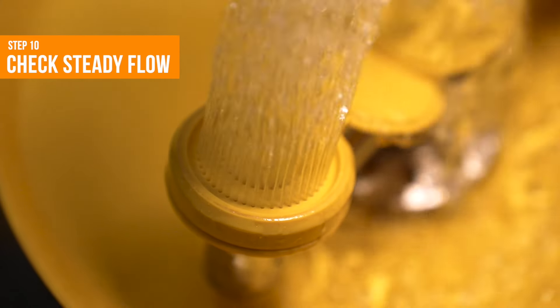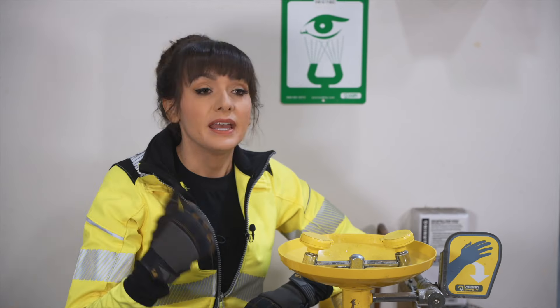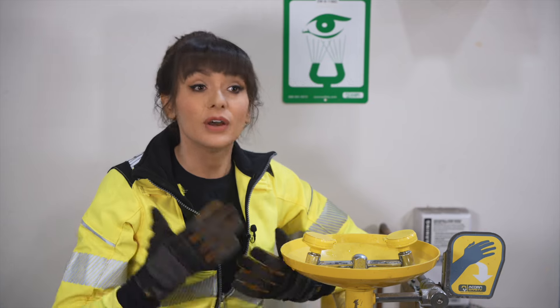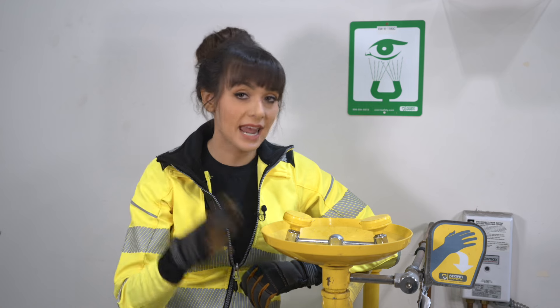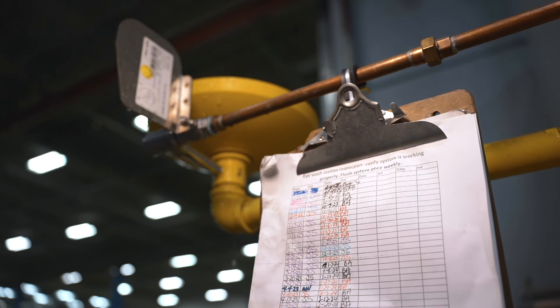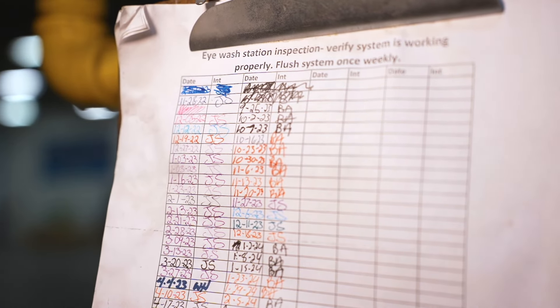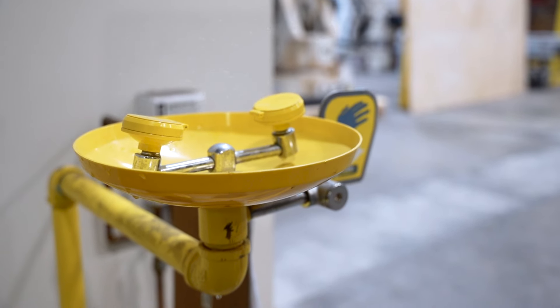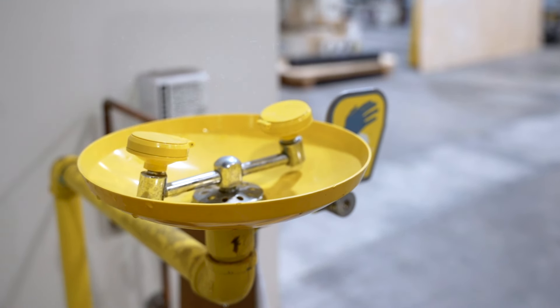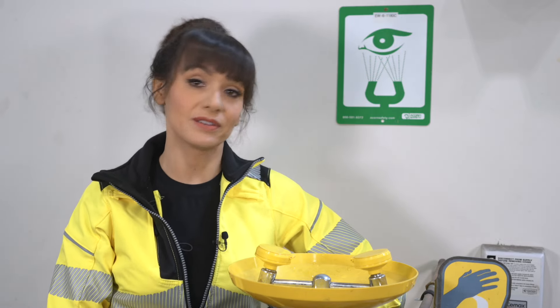And step 10: Make sure the water continues to flow steadily until you purposefully turn it off. If you find issues you can fix yourself, go ahead and fix them. Otherwise, report any issues to your supervisor or team leader and tag out the eyewash station until it can be repaired. Document the inspection on the unit's inspection tag and in a centrally controlled documentation log if you have one. Keep in mind that your eyewash stations are crucial emergency equipment, just like first aid kits and AEDs. We don't want them to fail when needed most, and weekly inspections are a quick way of making sure that they don't.